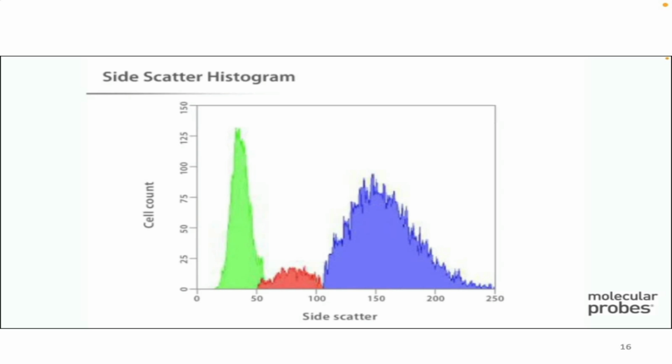And so we'll say I might look at 100,000 cells. The first cell might be kind of tiny and not have any granules, and so it would be low forward scatter and low side scatter. Then I might have another cell that was huge and had tons of granules, so it could be high forward scatter, high side scatter. And then maybe I'd have another cell that was tiny with lots of granules, so it might be up here. And I'd have another cell, and I would have a dot for every one of my 100,000 cells telling me both how big and how granular that cell was.